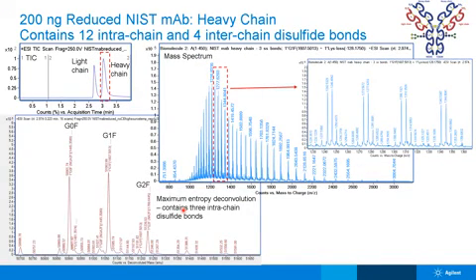We also looked at the heavy chain within this map, the second peak in the TIC shown here. Here's the charge state distribution that we observed, ranging from about 900 to about 3,000 m/z. And if we zoom in on some of these charge states here, you can see the glycoforms retained on the NIST mAb for these different charge states.